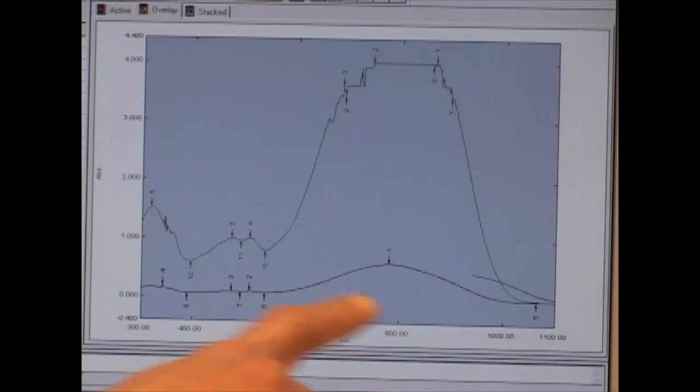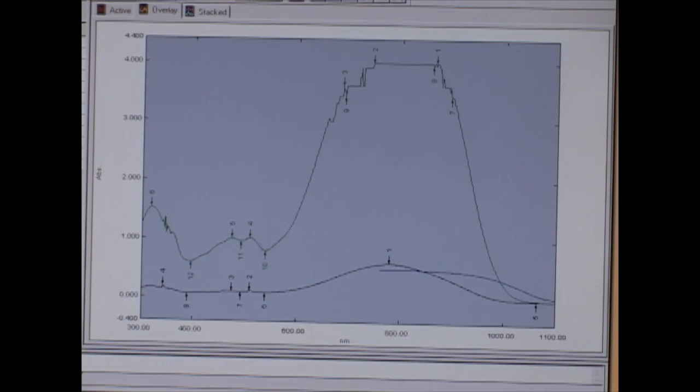You can see they are slightly different. Since we do not know the exact concentration in the thin film, we cannot calculate extinction coefficient. The important information from absorption in thin film is the wavelength, maximum wavelength.